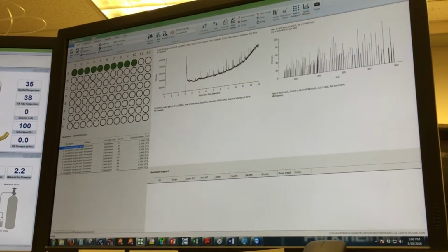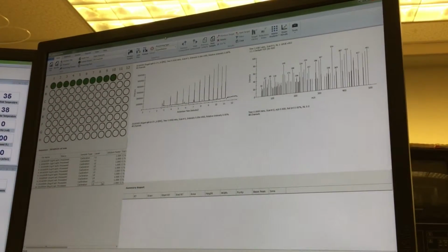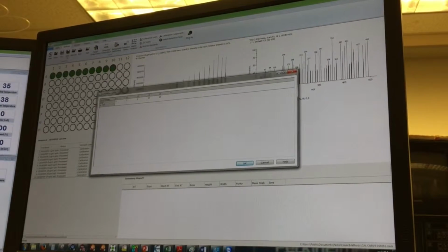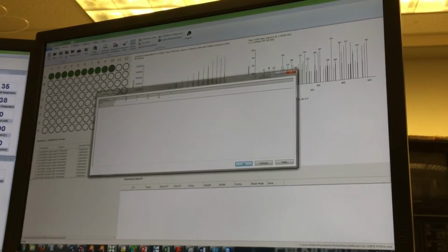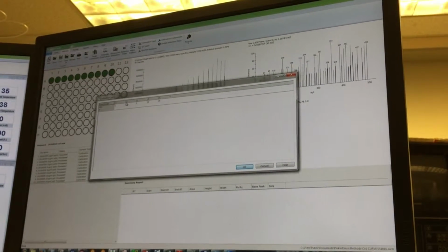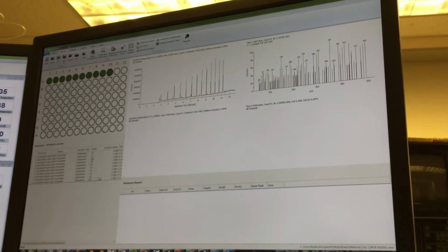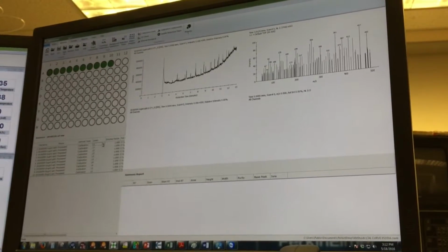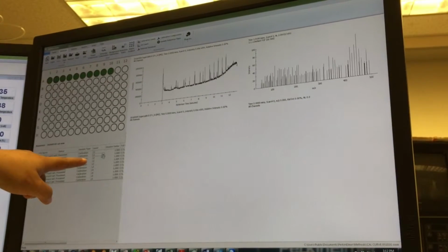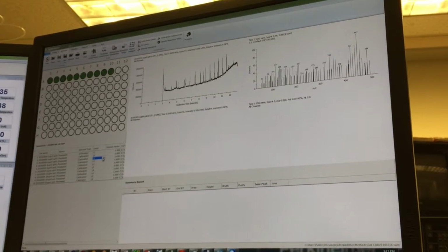Go to quantitation result. So from home you have method, calibration level. Always check the level groups, the numbers you have put. So this is L1, this is L2. Sometimes you can put A1, A2, but always remember that the name you have given here, you have to upload here the same name. For L1, this is for L1, and here you have to choose L2. Never choose L1. If you choose L1, it will give a wrong result.